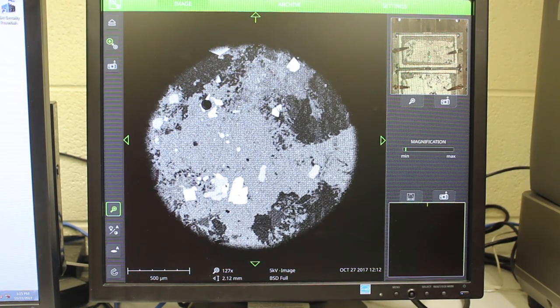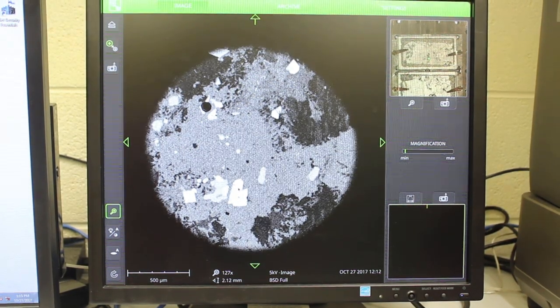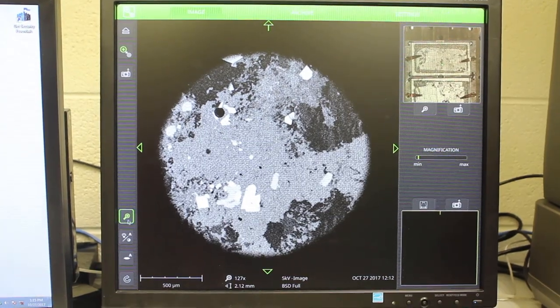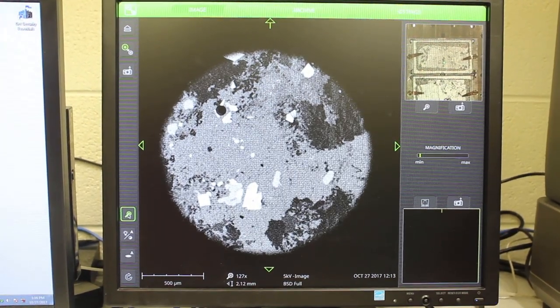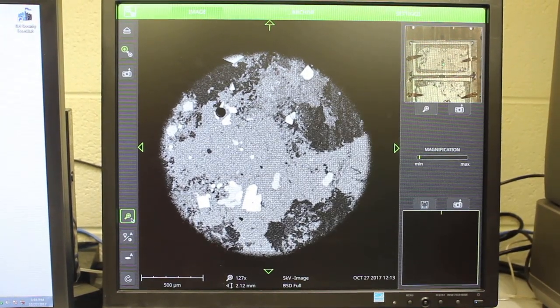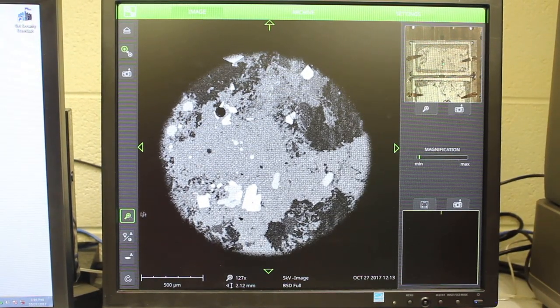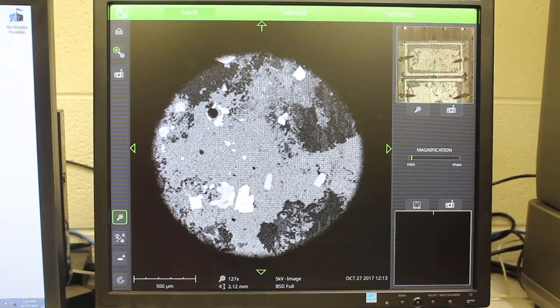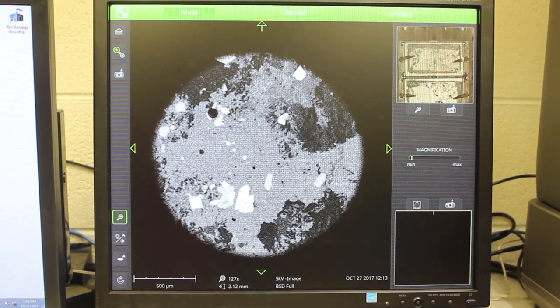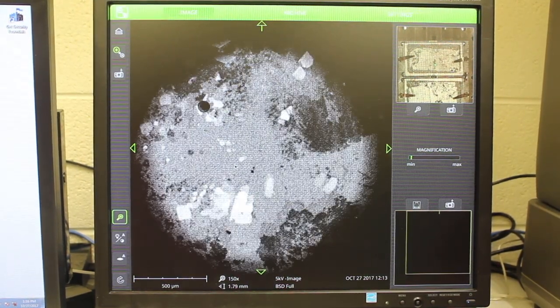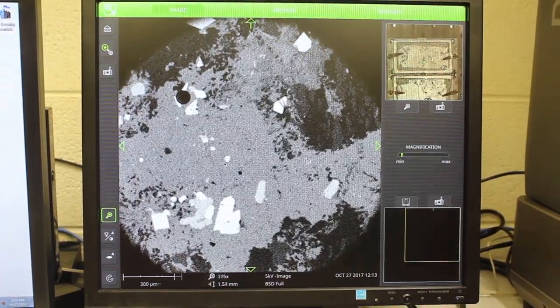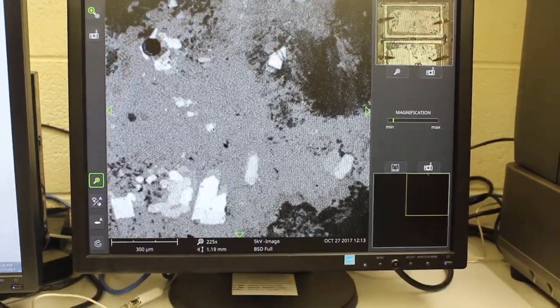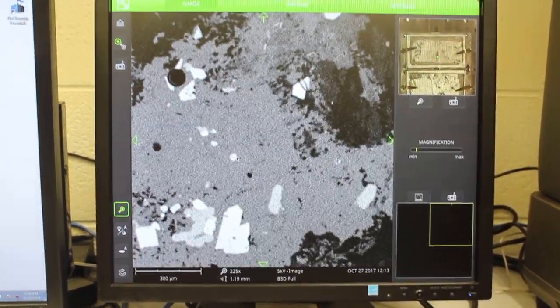The button at the top with the magnifying glass is the zoom in and out button. If you select that and then use the middle scroll on the mouse, you can zoom in and out, and especially on this one you could zoom in to see more features and get much closer up than this picture.